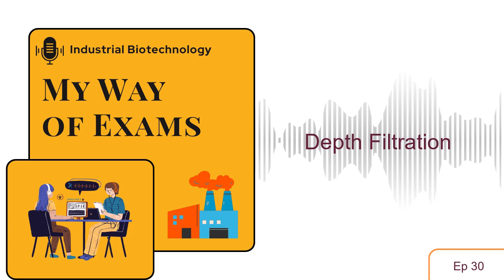Right. It's pretty amazing. So does that mean different types of depth filters are better for different particles? Or is it more about just how much stuff you need to filter out, like the total load? It's a little bit of both. You do want to choose the right filter for the job, of course. But let's talk about the different types. So the simplest kind are called packed bed filters. Packed bed. They're basically just columns, like tubes filled with granular material. Sand, sometimes, or diatomaceous earth, things like that.